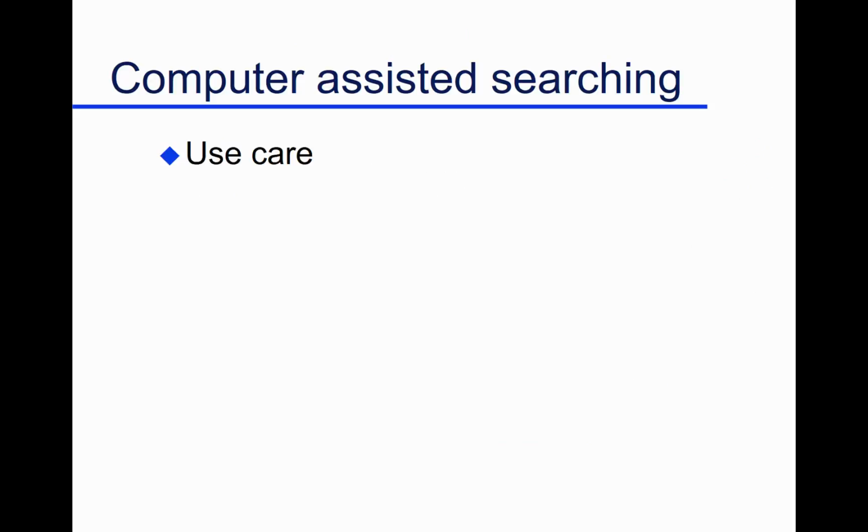Computer assisted searching: let's say you're not a person who lives with mass spectrometry every day of your life in dealing with the data, and you just want to come in and use it.